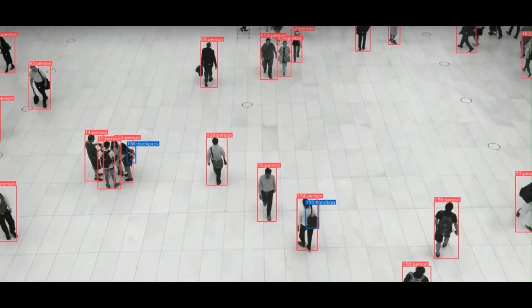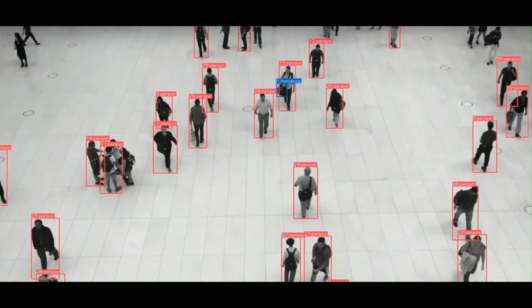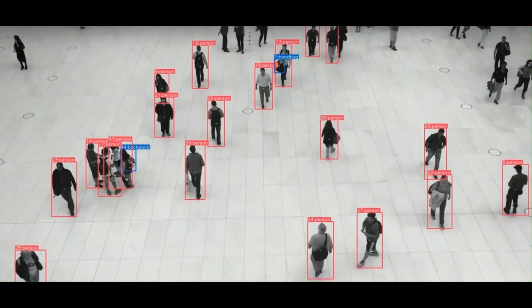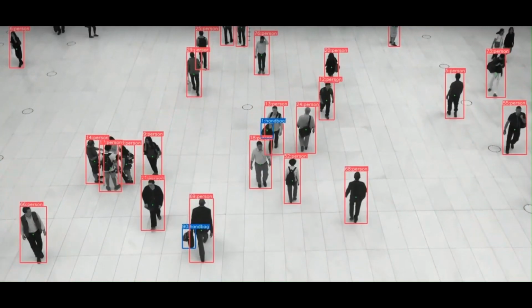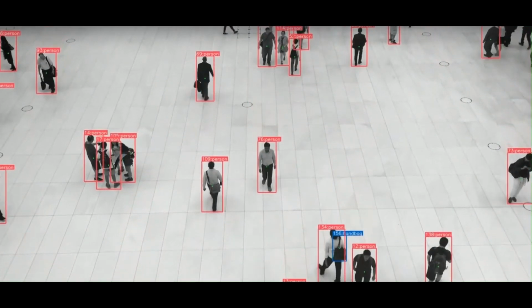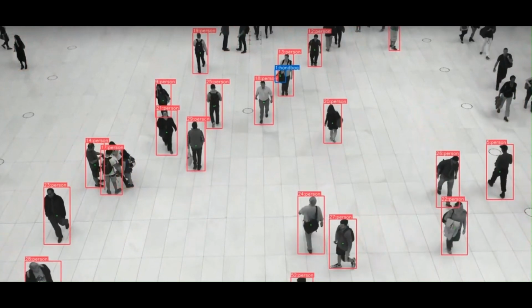So that means that if I had dozens of agar plates, I could put them on some type of conveyor or Rolodex system, and we can then count all the colonies very, very quickly, and they could go right back into their incubation chamber while the computer has already assessed all of the colony counts. So this just gives you an idea of the range associated with computer vision.